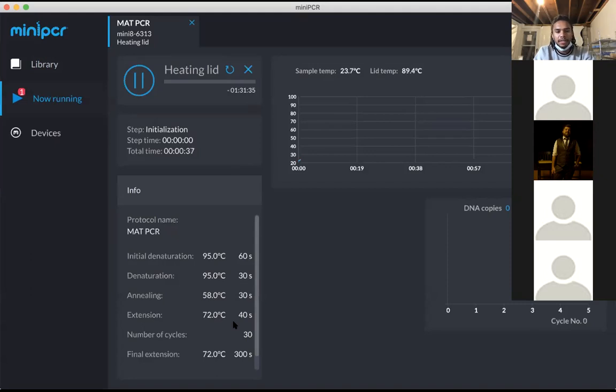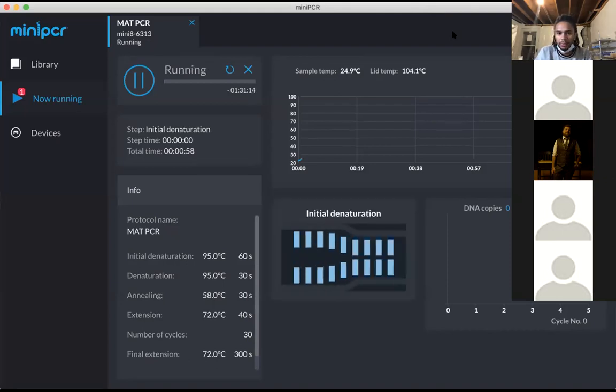And all of those processes, what happens is the DNA that we put in there is gonna split apart. The free letters from the master mix are gonna match up with their opposing letters on the DNA that split apart. And then it's going to come back together and you're gonna have one copy. So by the end of this, which is probably gonna take like an hour, which we're not gonna follow through to the end of this because that's too long, but I'll keep you guys updated.